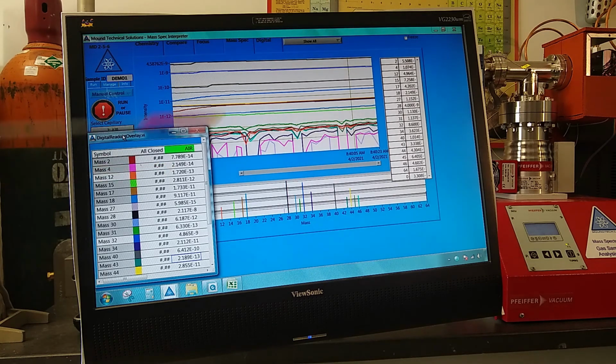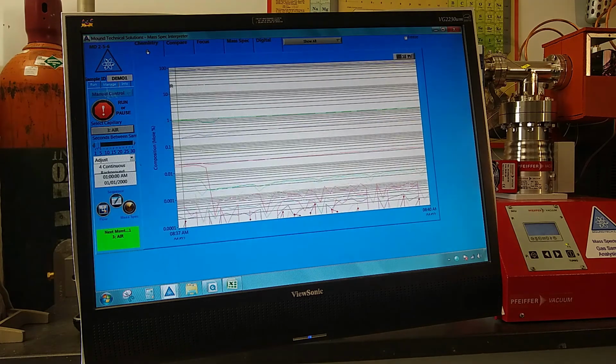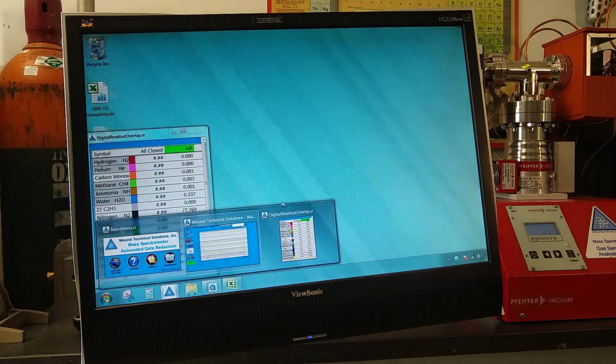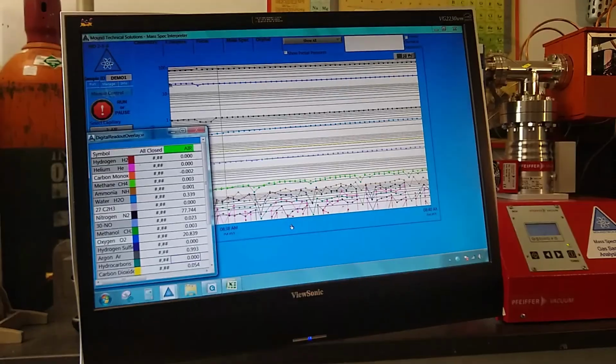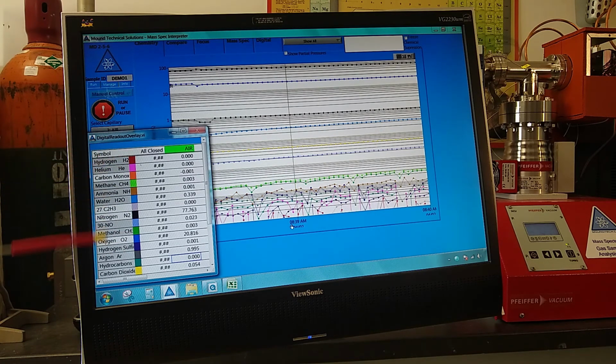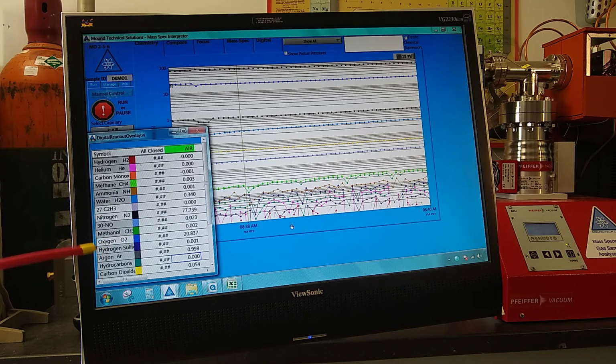As you can see, this is very good information, but it's not quite as user-friendly as we would like, so we've built an interpreter into this. We put this on our chemistry screen. With this, we're able to observe that same data presented in mole percentage information. So that information that was giving you mass units is now converted into which component of gas it represents.